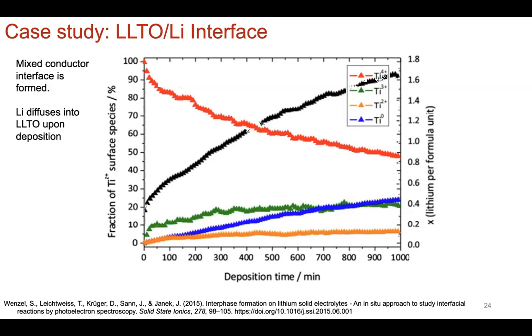But this is a great study to show that you can do these kinds of probes all in one go, even though it is extremely challenging to operate in ultra-high vacuum. You can still do these nicely controlled studies to look at the type of decomposition products that you have. Okay. The next example is sodium-ion battery electrolyte and additives, but we will continue that next time.